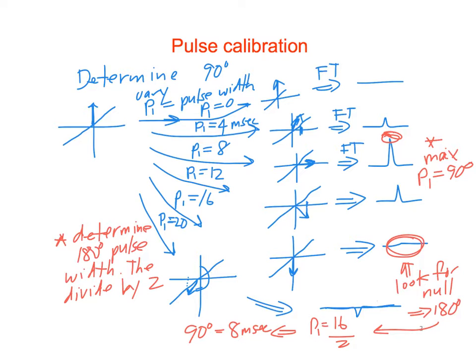The one thing you have to make sure is that when you do these, each of the spectra are phased the same, right? Because you can change the phasing, and so even though at one point you have a negative peak, if the spectrometer automatically phases it to positive, then it's going to mess the experiment up. So don't even manually phase it, just leave it as is?